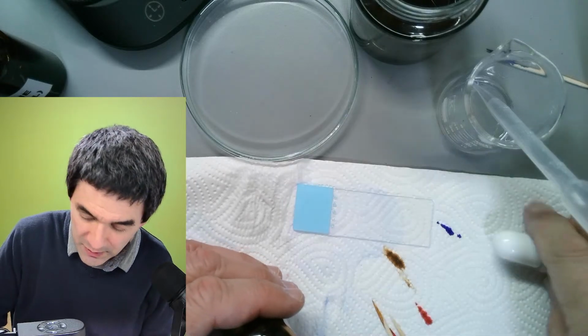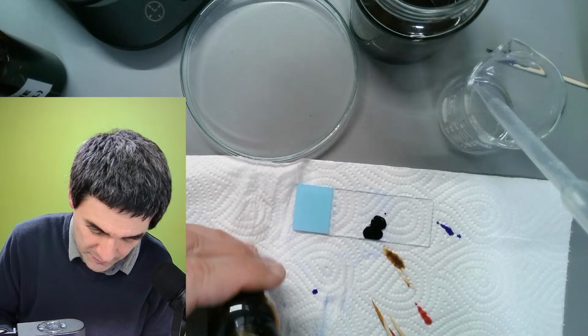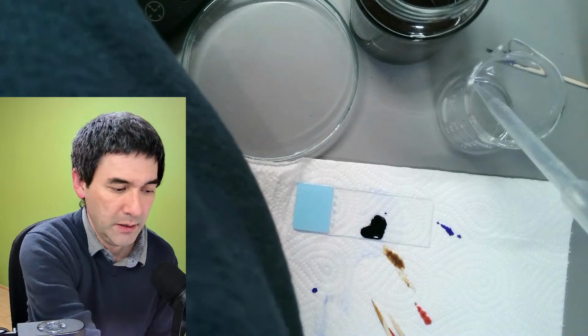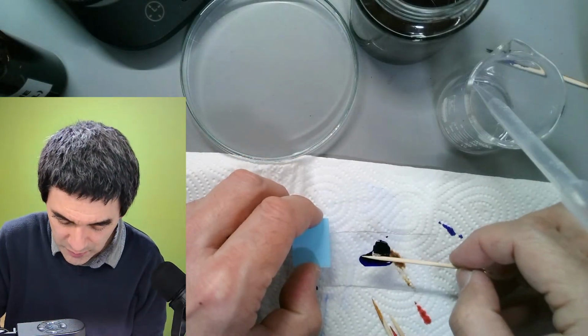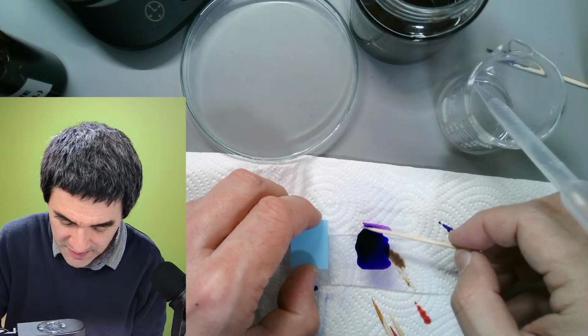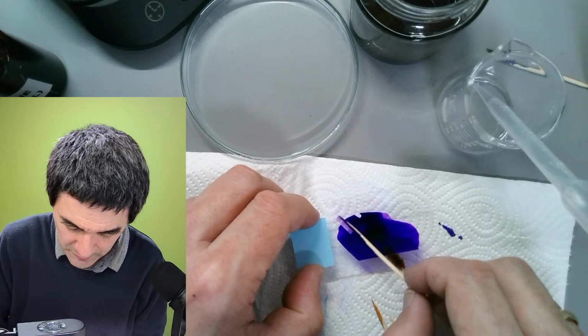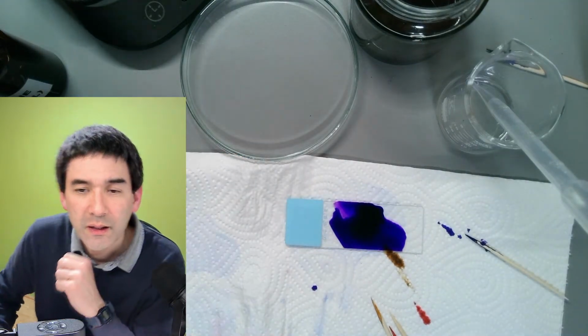So this is actually also for me something new. So number one, and a toothpick to spread it because I want to save the stain. Okay, here we go. 1 minute.